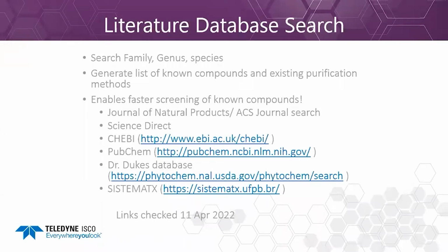Search the family, genus, and species, and this will generate a list of known compounds and existing purification methods. These links were checked very recently, and so they're not dead links as of today, and they contain useful data as of now. Assuming you have your screen shot, I'm going to move ahead now.